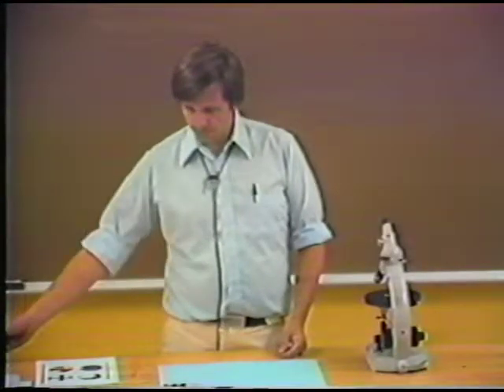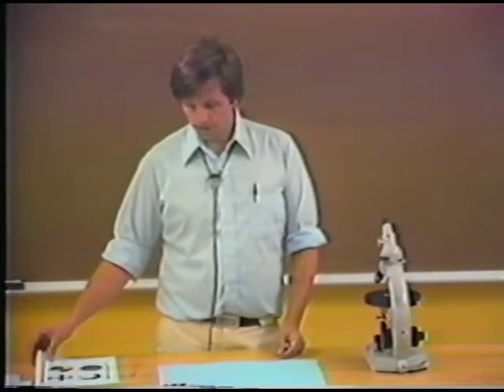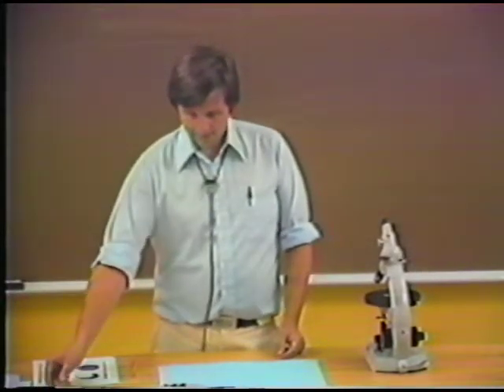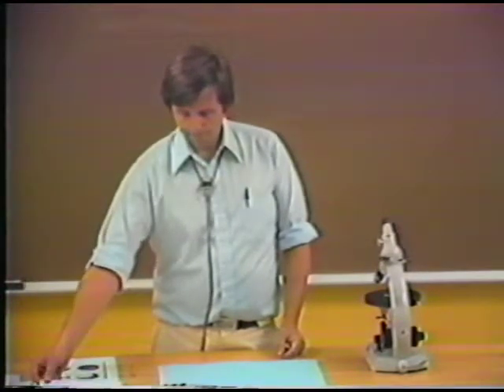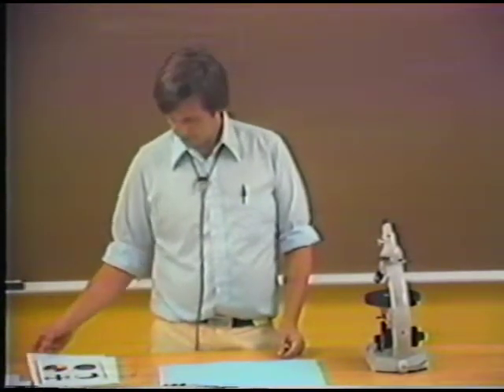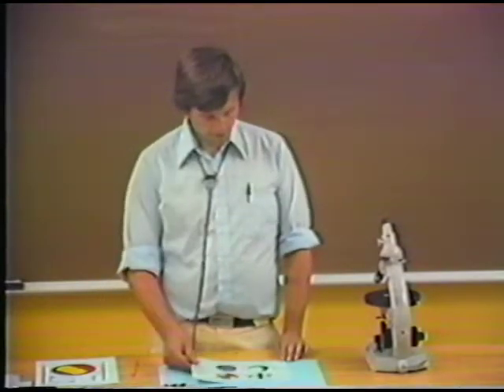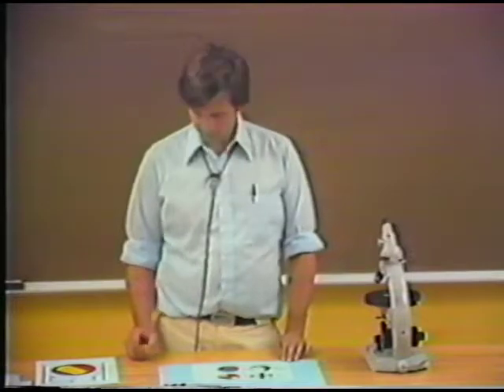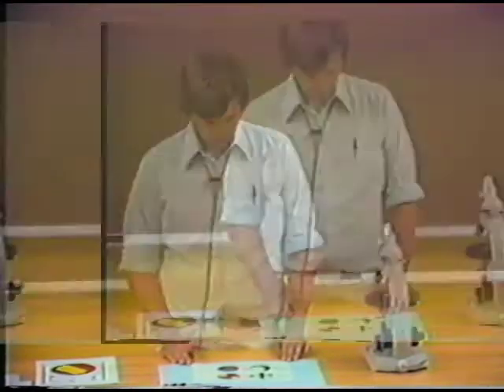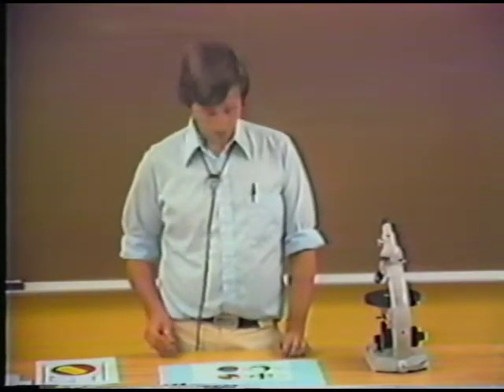Well, another thing that's very useful to know, of course, is the sign of the mineral. Now, the sign of the mineral can be determined with accessory plates, and I just want to refresh your memory about sign determination again.